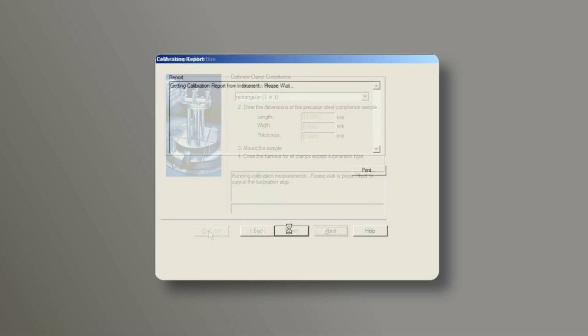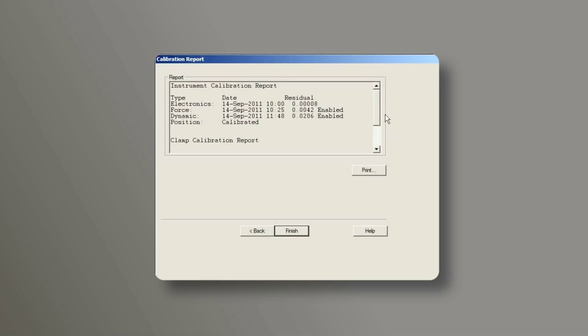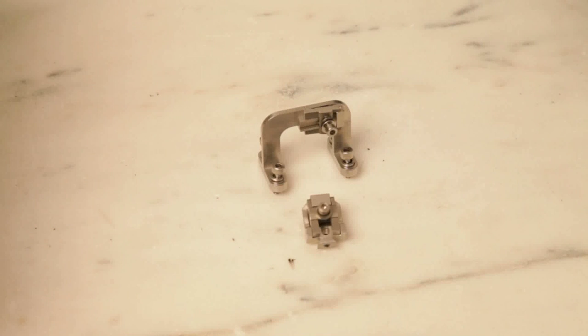After the calibration, check the report. Make sure the clamp compliance value is lower than the maximum value that is shown on the right side of the screen. You have now finished the film tension clamp calibration.